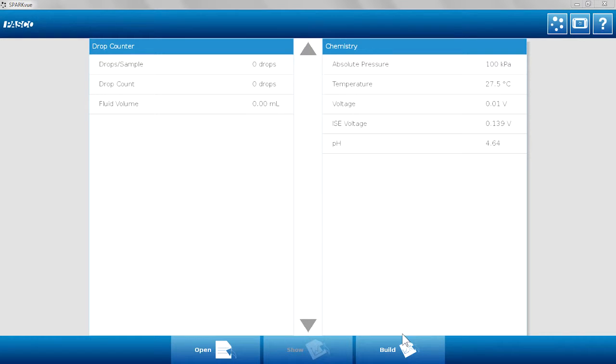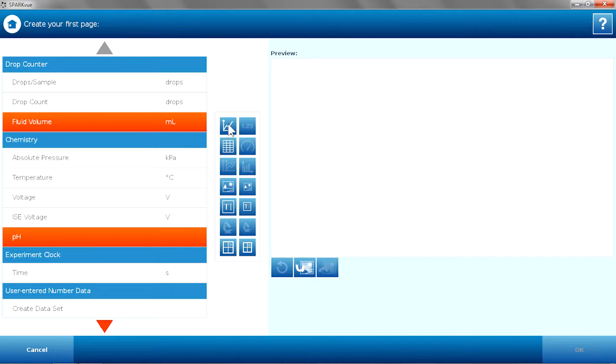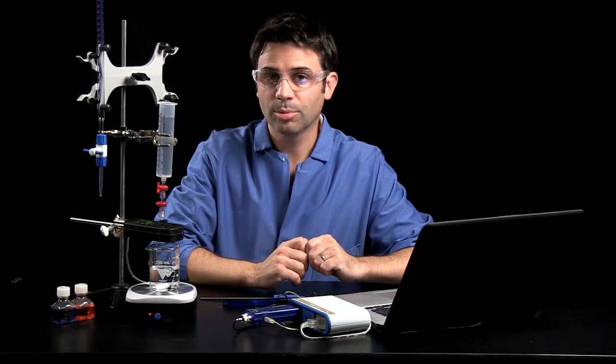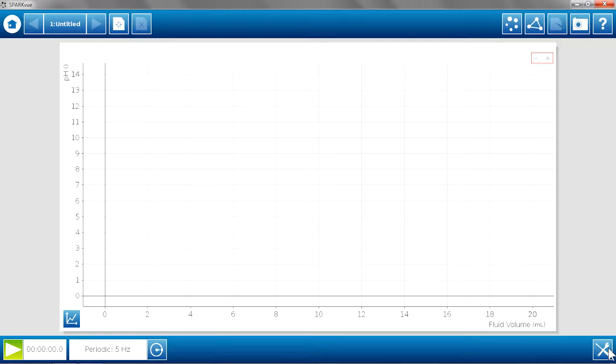I'm going to build a graph, build a page of pH versus fluid volume. Now with any titration, you want to do some calibrations beforehand. You want to calibrate the pH meter, and to calibrate in SPARC, you go to the tools.